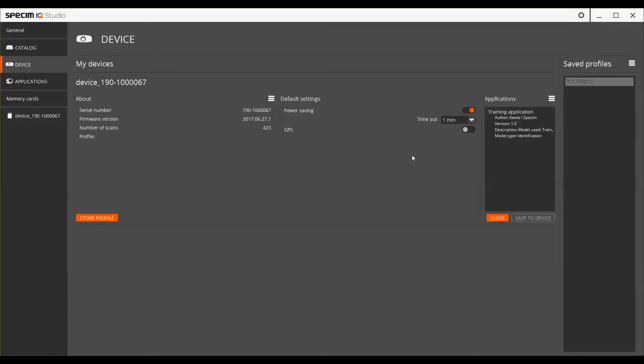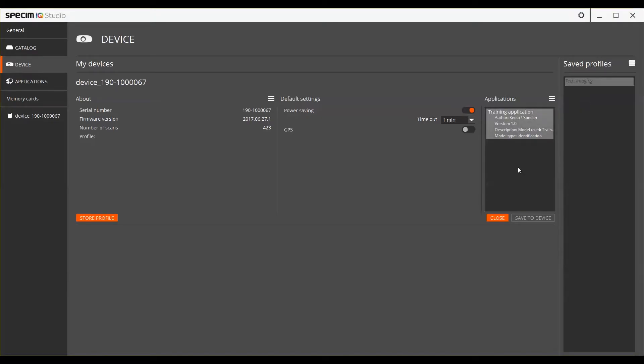To remove an application, click on it and select Remove from the burger menu. If you wish to delete all of the applications installed into the camera, press Ctrl-A and then select Remove.